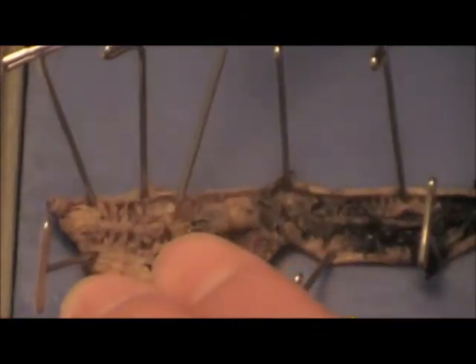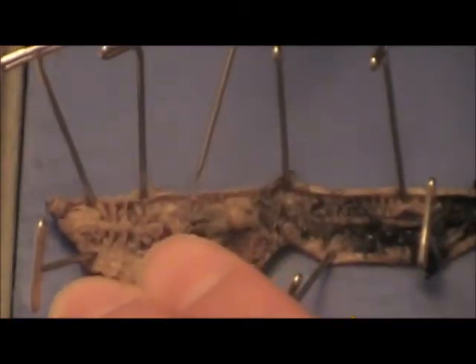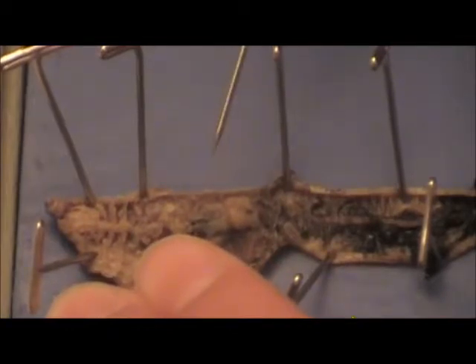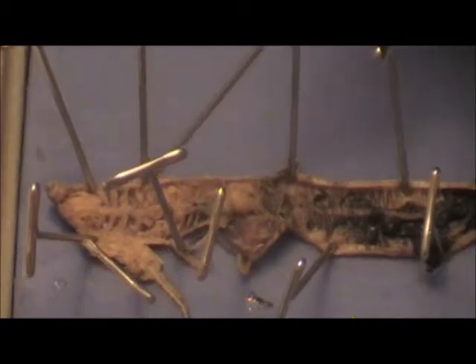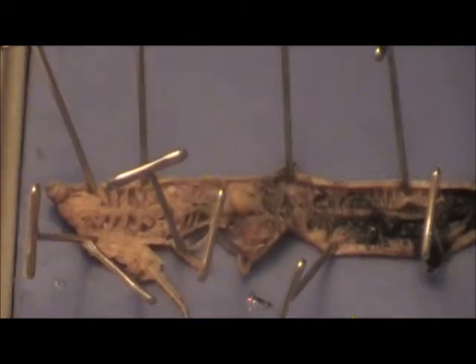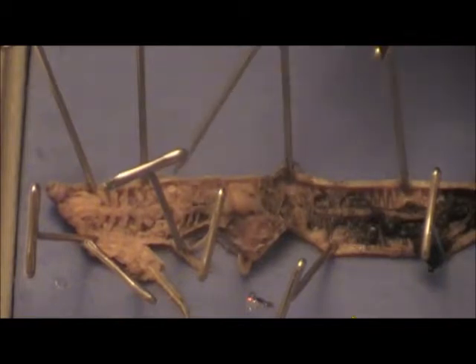All these little bulbs here, these are called the seminal receptacles, the testes, or testicles. The ovaries, the oviduct, the sperm duct, and basically all those things I can't really identify. This is my first time I've dissected anything, so I kind of damaged it.